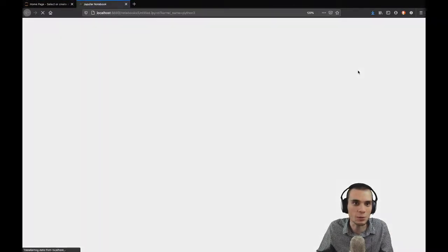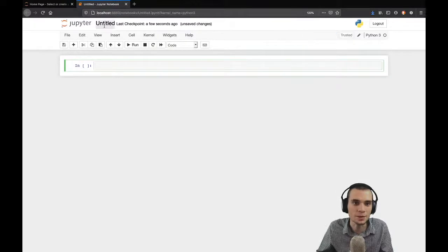So this is all going to be using simulated data. So no real data is going up on here, but I'm going to show you kind of the workflow, whether you're a colleague or just another researcher in another group that's interested in duplicating some of the methods that I've been using. So I'm using Jupyter Notebook. It's a way to run Python scripts and prototype them really quickly, and then also share them where other researchers can make tweaks and see how small little blocks of code run.